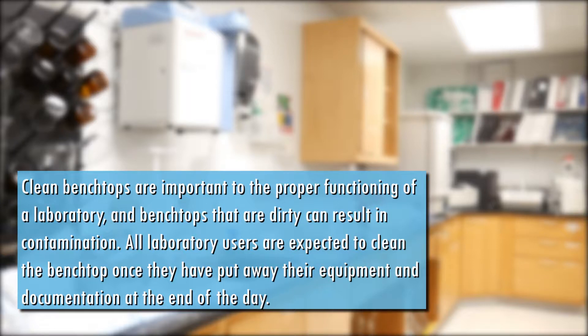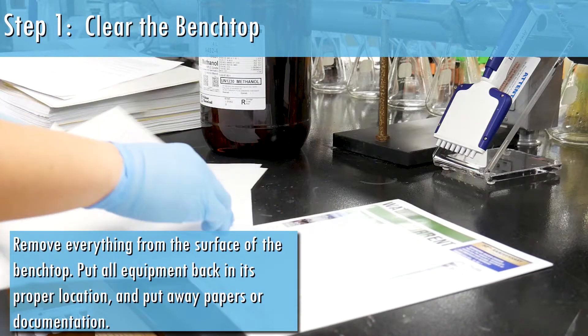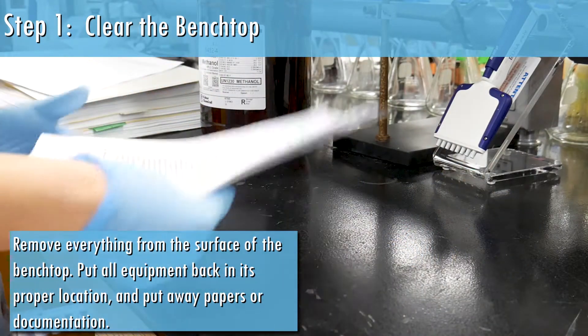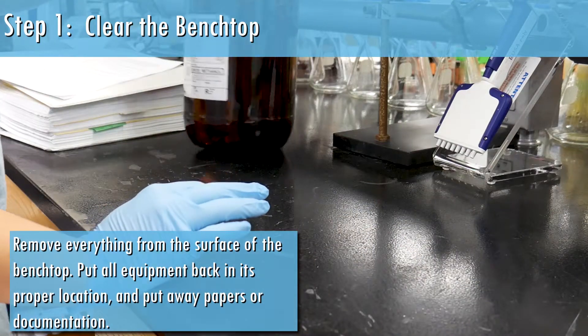All laboratory users are expected to clean the benchtop once they have put away their equipment and documentation at the end of the day. Remove everything from the surface of the benchtop. Put all equipment back in its proper location and put away any papers or documentation.